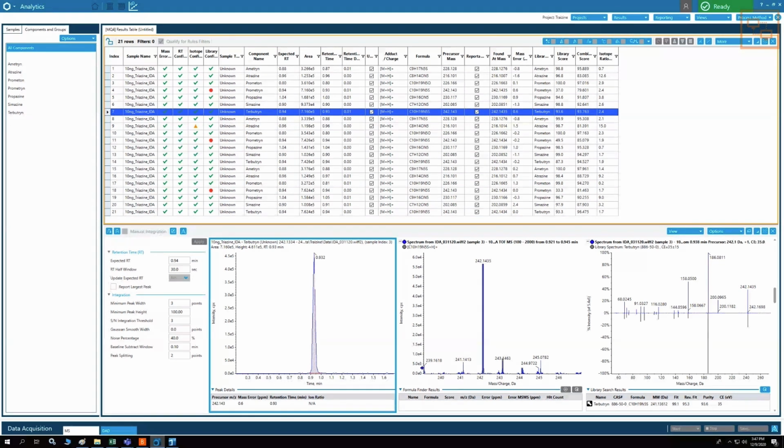See that it has a match. Which peak doesn't have a match? See the 200, right? 200, yes. Yeah, 200 has no match. But unfortunately, 200 by percentage of intensity is quite small. So it's not affecting the purity as much as the 186 was in the prometryn. So here we don't see a match. The purity is only affected a little bit, but still it's not a perfect match.